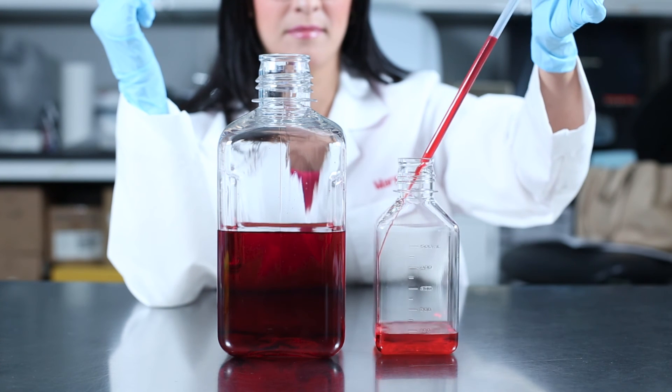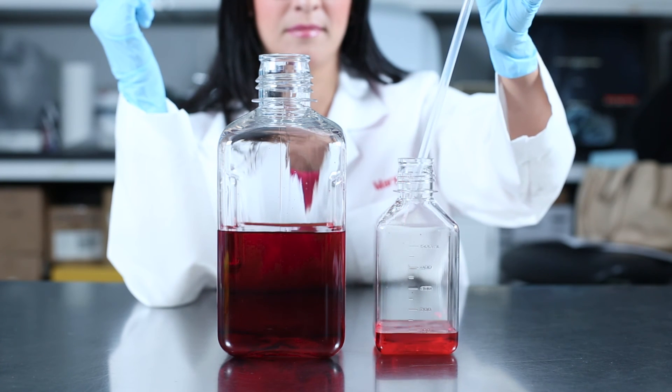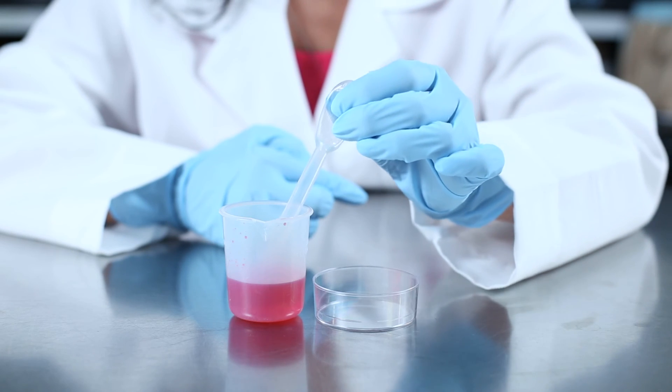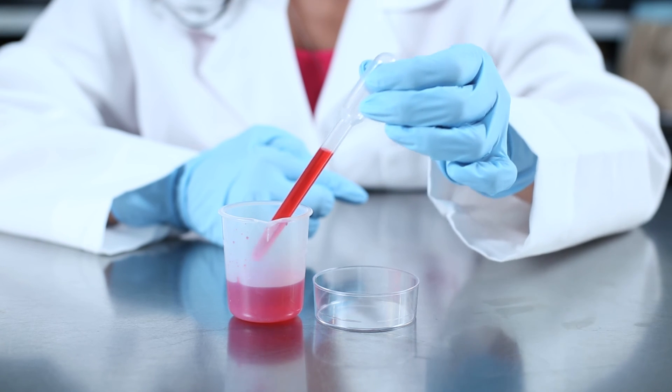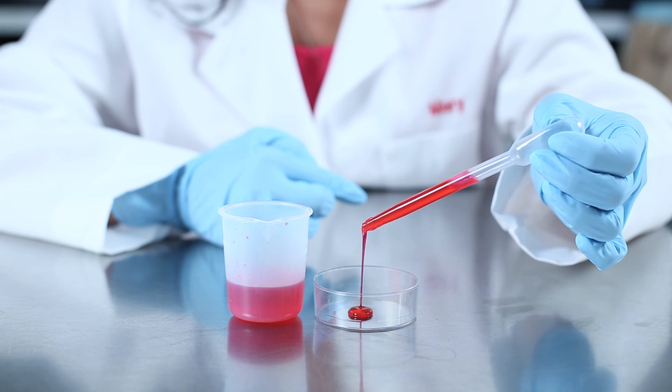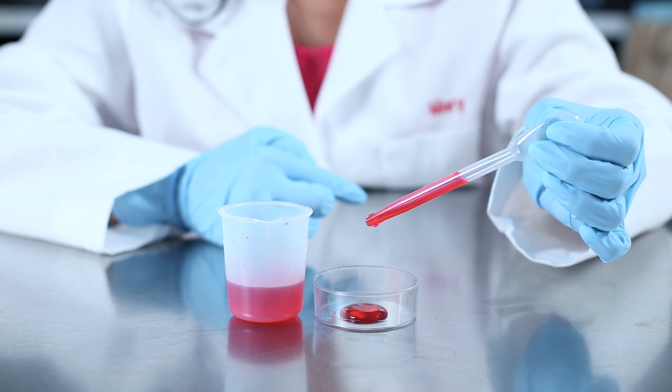These transfer pipettes are used in a wide variety of industries. A useful but not widely known slurry transfer pipette is shown here. The bore size is twice as big as our standard transfer pipette for use with viscous liquids such as oils or paints.